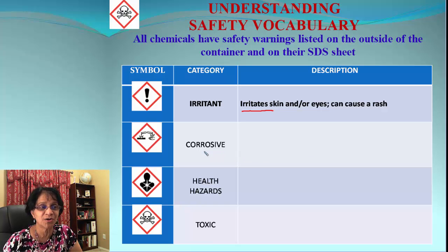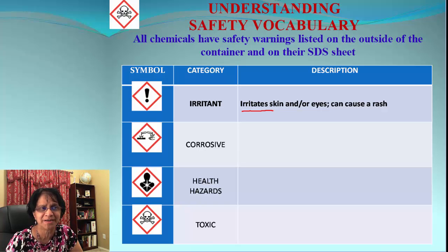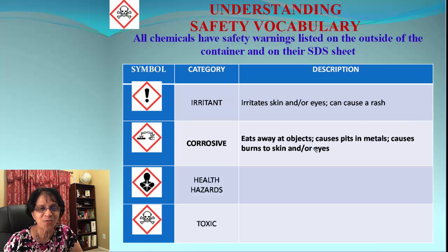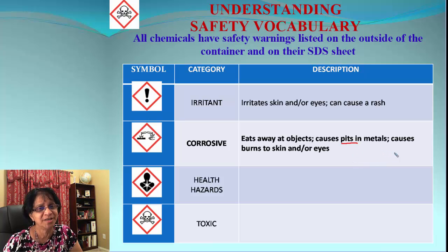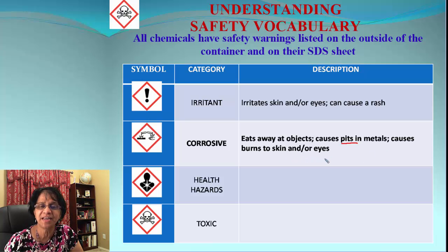Next is corrosive. If you look carefully at the GHS symbol, you can clearly see it's as if the substance is eating up the metal. It eats away objects and can actually form pits in metals very quickly. It can do the same thing to your skin, causing burns to skin and eyes. So if any chemical is marked as corrosive, you have to be extremely careful.